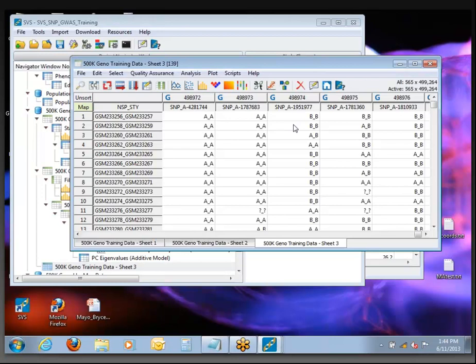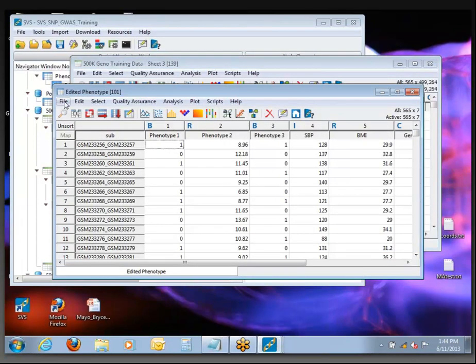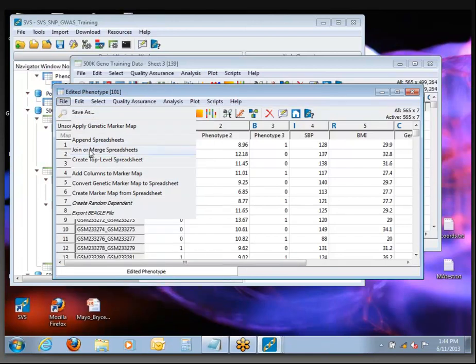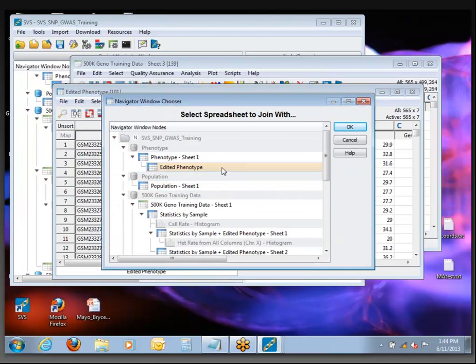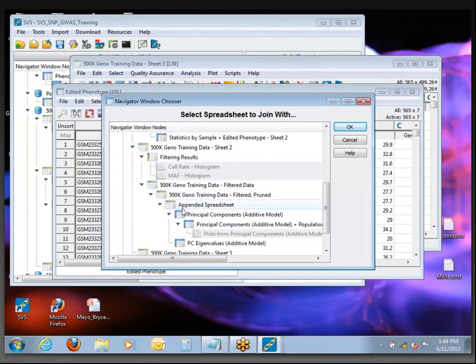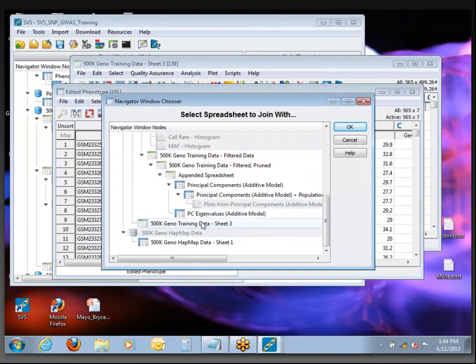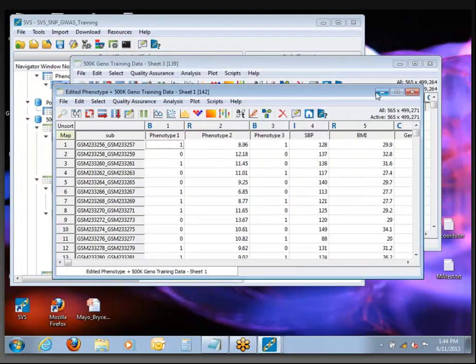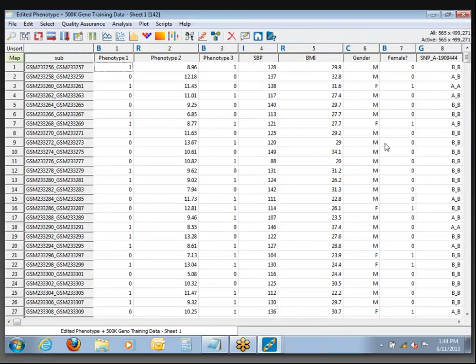So, let's come back to the Edited Phenotypes and join phenotype together with genotype. Go to File, Join or Merge Spreadsheets — this should be getting pretty familiar by now. I'm going to merge it with that one we just made by activating all the rows and columns, or even take the first one in the list. It doesn't really matter for now which one you select. Merge this with OK — we're going to get a new spreadsheet with phenotypes and genotypes together.